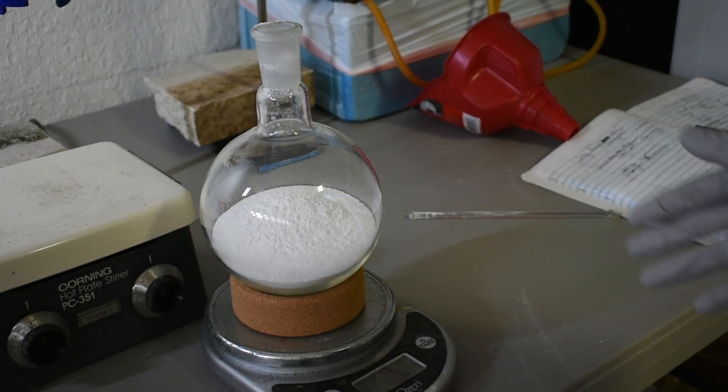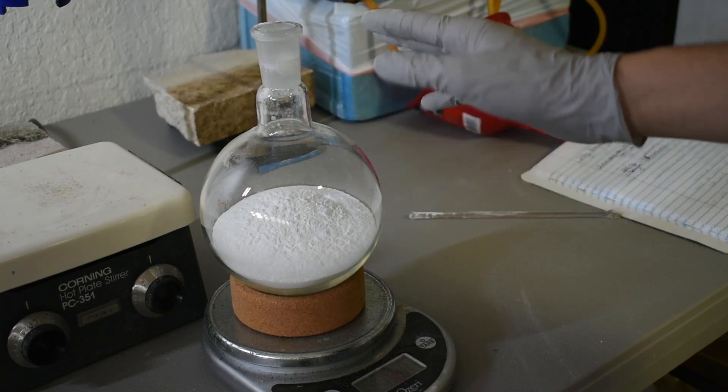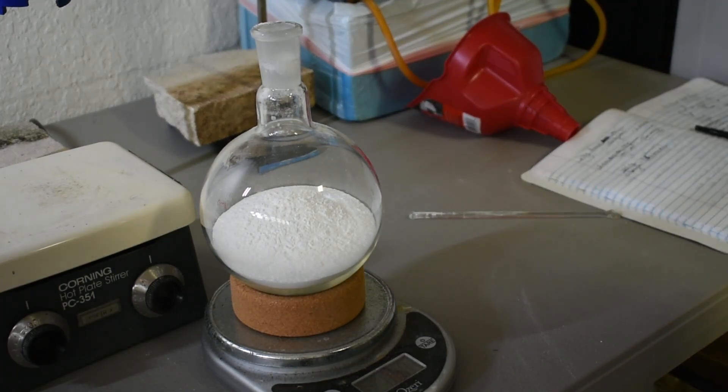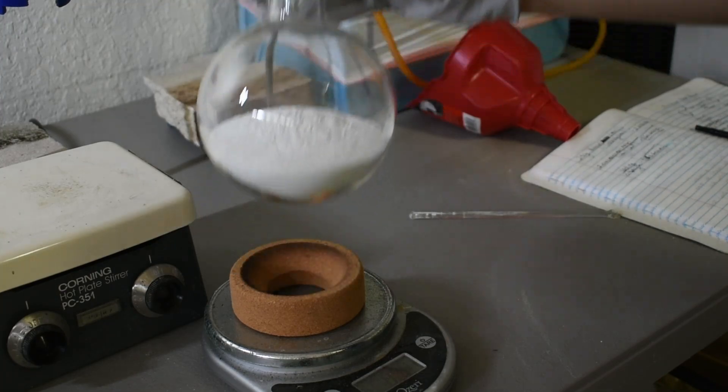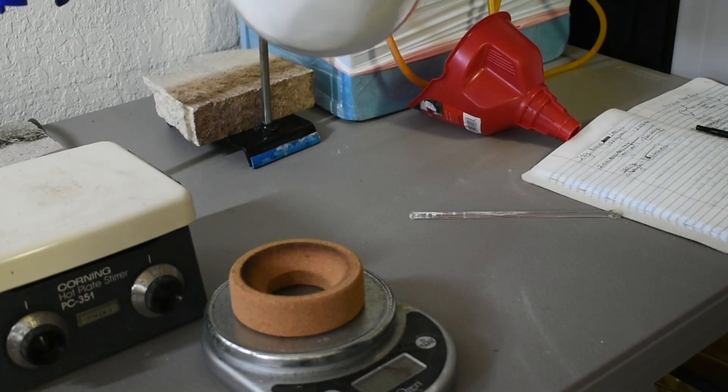Alright, I've weighed my flask and cork before and after. It turns out I actually have exactly 250 grams, so I don't have to do any extra calculations. As you can see, it's a very fluffy white powder.